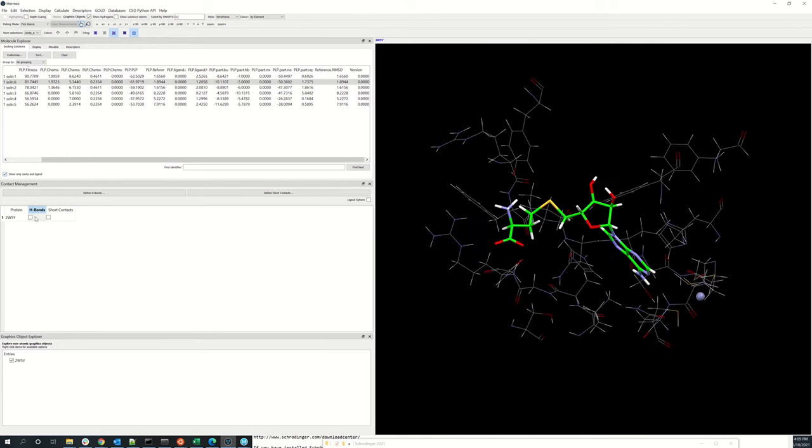You can use the contact management window to display also the hydrogen bonds and the short contacts.